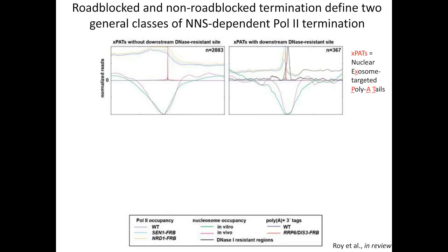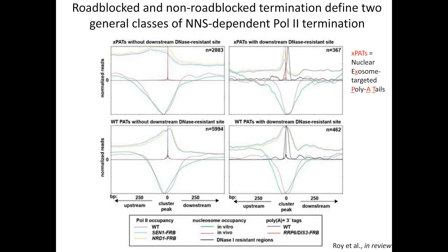In the presence of a downstream DNA binding protein, the accumulation of RNA polymerase is much more pronounced at the termination site. And we can see that when the NNS pathway is inactivated with the SEN1 or the NRD1 depletion from the nucleus, the RNA polymerase II occupancy is increased at these termination sites, indicating a lack of termination. So when we look at the non-exosome targeted poly A tails, so these are the poly A tails in wild-type cells that are typically on the protein-coding mRNAs, we can see that this behavior is not observed.